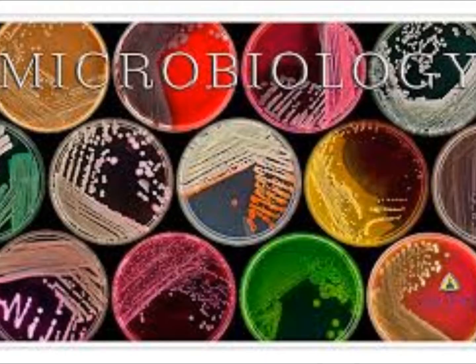So an example of the one that's got the thin halo is like a group B strep. Sometimes those are hard to see. Sometimes you don't see them till the second day. You might not see it on the first day. And we'll keep a set of these plates on either side of the room when you're looking at the real plates if you want to come compare to help.